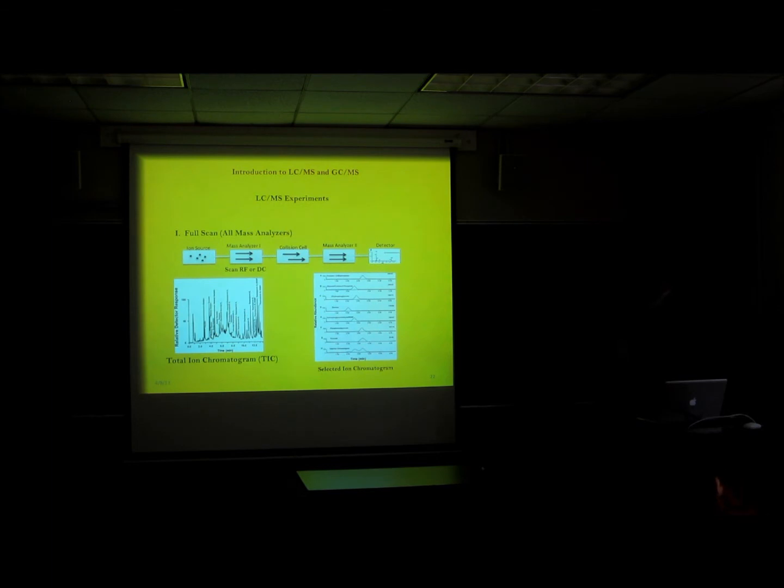Most of the experiments I'm talking about here you can do with other dual mass analyzers as well, like a quadrupole time-of-flight. You can do everything we do here with a QTOF, with one exception that I'll discuss that you can do with the triple quad. But we'll talk about this from the standpoint of using the triple quadrupole mass spec.